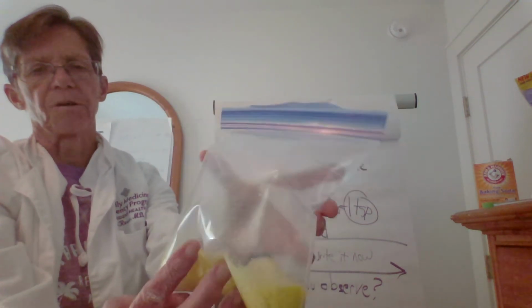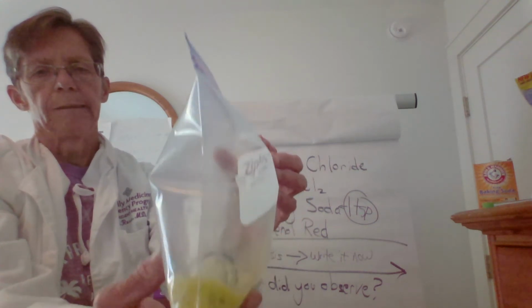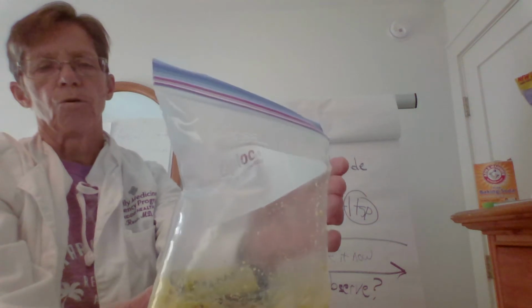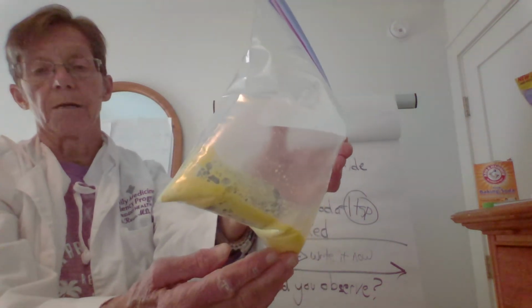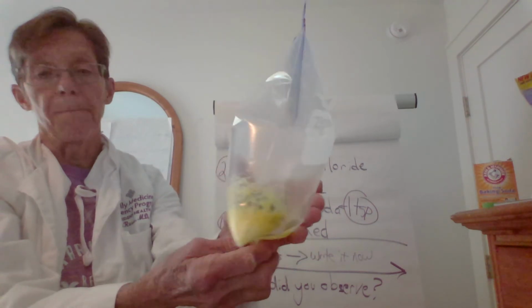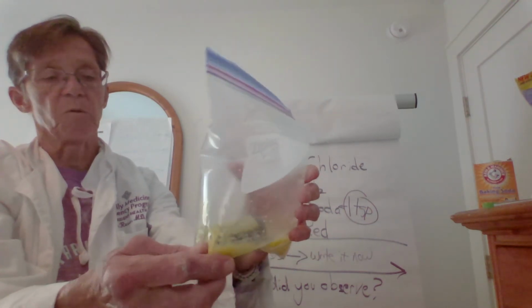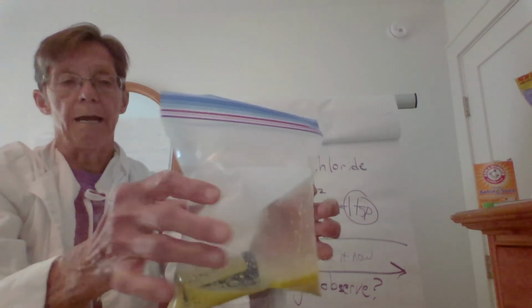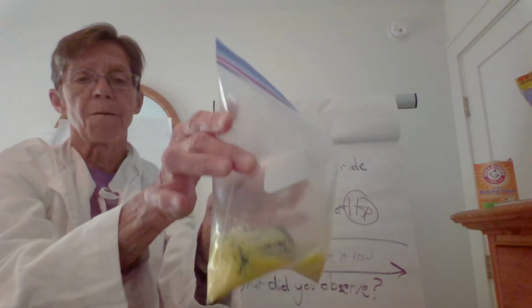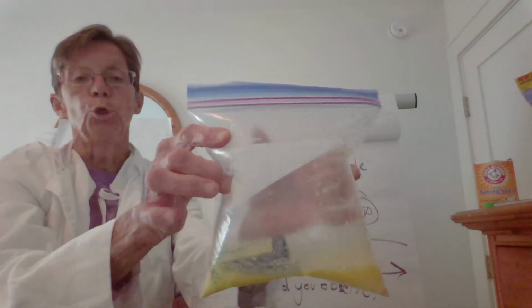Hopefully you notice something about the bag, right? So obviously we have some yellow. Obviously everything got mixed up, okay? So we're never going to get that stuff back again. But look at the bag. It got pretty darn big or fat. It kind of blew up, okay?